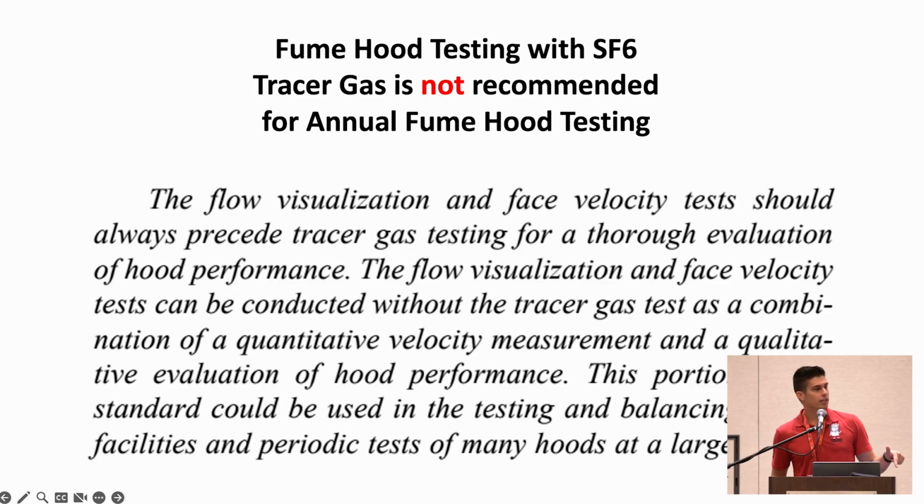Now, in my humble opinion, I like the numbers, I like the data, that's good. But what about this quality? What about the qualitative evaluation of, is the hood keeping you safe? Is the hood keeping chemicals inside, or is it allowing chemicals to escape? So that's really the punchline. Data is good, but let's see what kind of quality that this fume hood actually has behind it. And ASHRAE, right from the standard, says, do that.